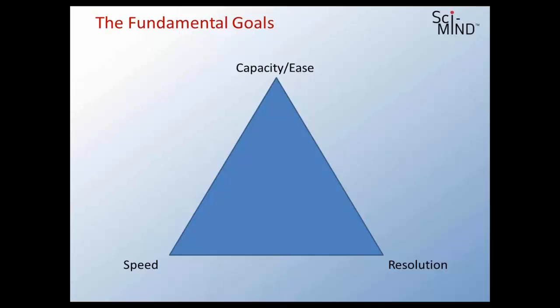Another goal we have in chromatography, of course, is high resolution. How many peaks can I separate? I'm going to need to get them really well separated. I need to get all kinds of matrix components out of there. So we want high resolution, we want fast, and of course we like methods that are easy to run and reproducible, high sample capacity, easy to inject on, and those sorts of things.